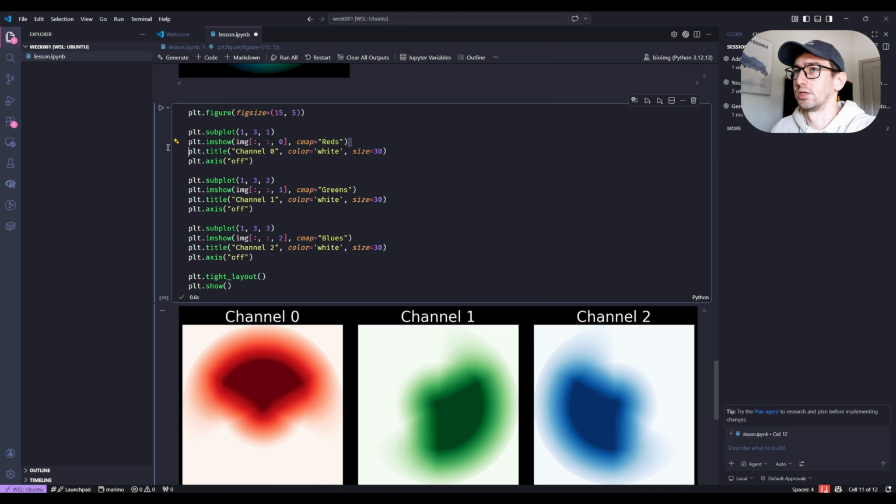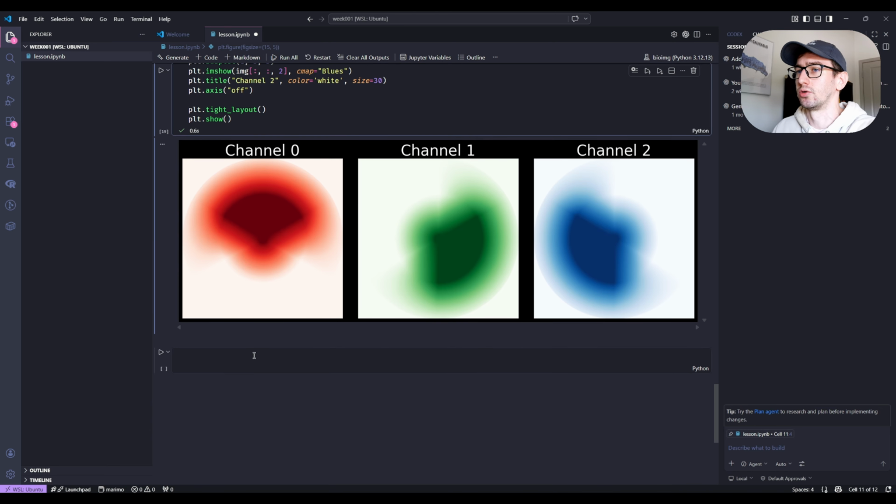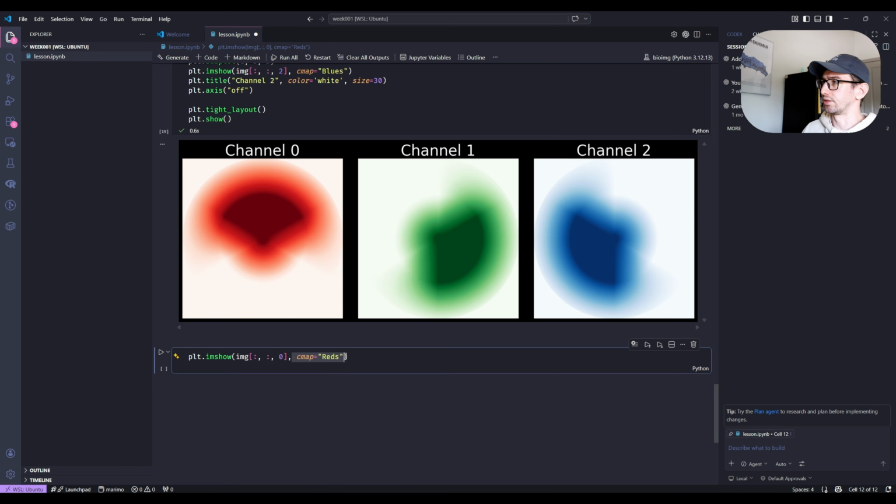Let's take a look at the particular call, because we know in advance that this is the typical structure of the data. Usually when we have a colored image, people store it in this particular order: red, green, blue. But the order can be different, and other packages could work in a different way.